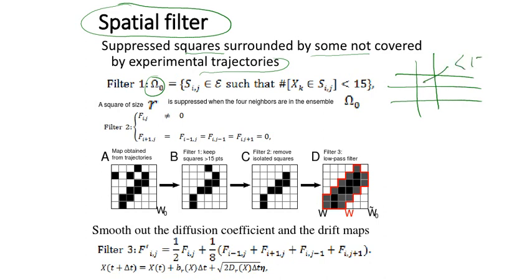If we have less than 15 points, we are going to remove them. So if we have here our image, we look at where we have this square, and in the first step, if they are less than 15, we eliminate. For example, this one has less than 15, so it is gone.